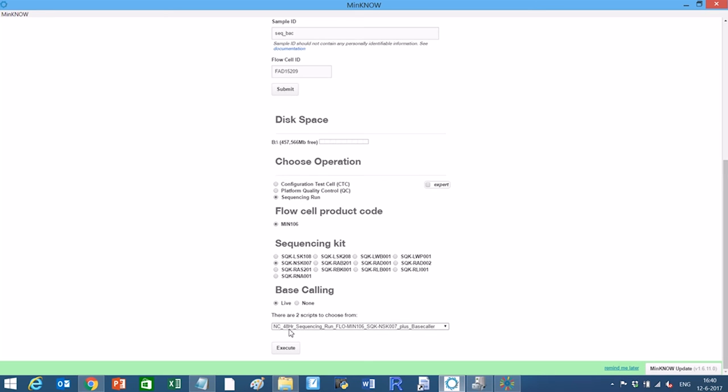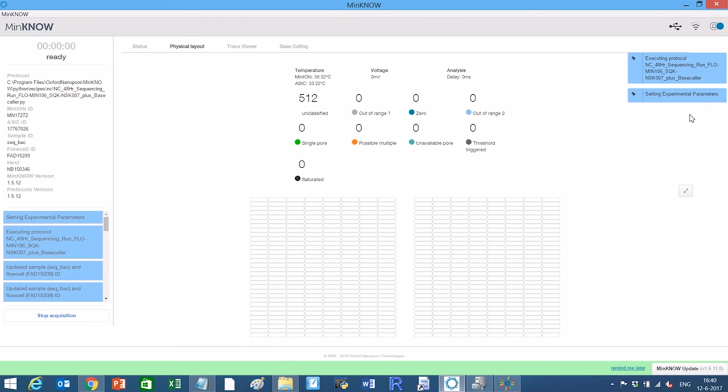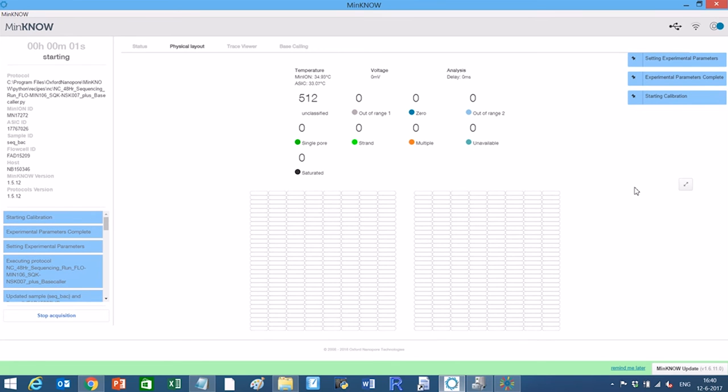Starting a MinIO protocol script. Progression of MinIO protocol script. Checking progress at the beginning of the experiment.